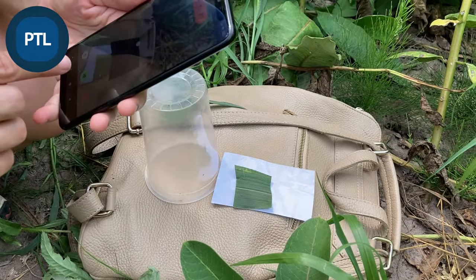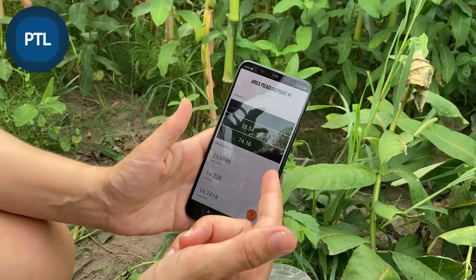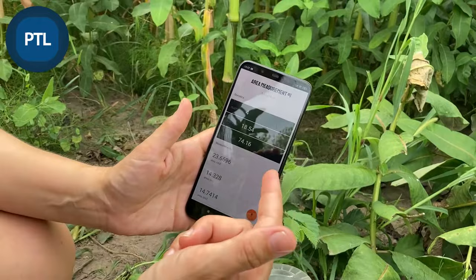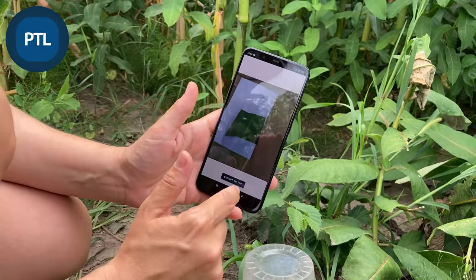Then I close the session and we see the average leaf area for all four pieces of the leaf. We can also see the sum of total leaf measurements. Below there is a list of each leaf piece's area, you can see the photo of it, and you can export it to PDF and share with your colleagues.